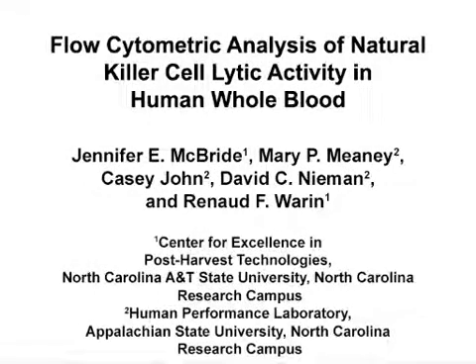The overall goal of this experiment is to determine NK cell count and cytotoxic activation levels in a human whole blood sample in a fast, reliable, and stable manner. This method can help answer questions in the immunological field, such as what are the effects of outside interventions on the bioactivity of NK cells? The main advantage of this technique is that it is fast and accurate, while still providing reproducible results across experiments.